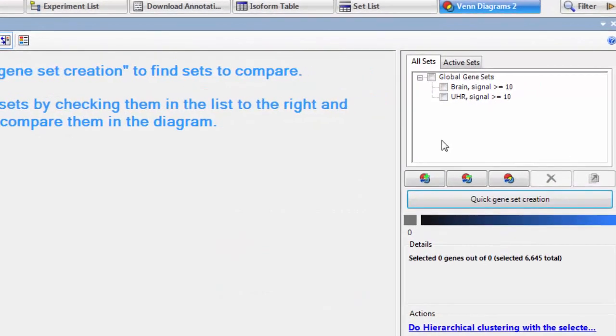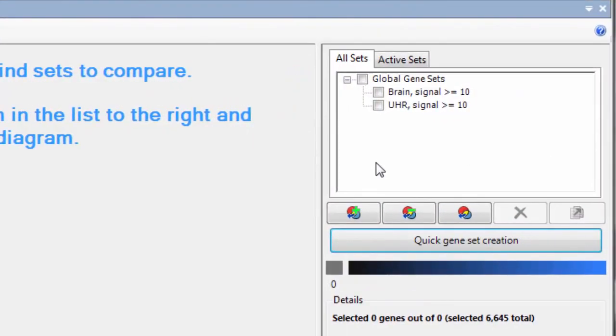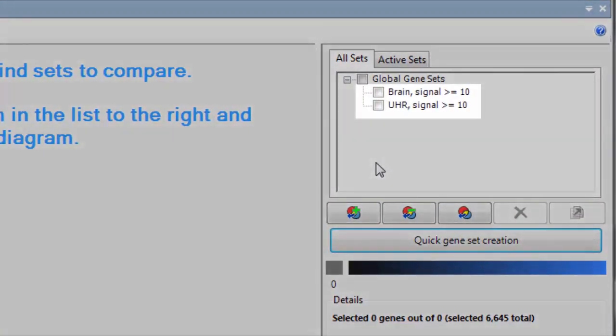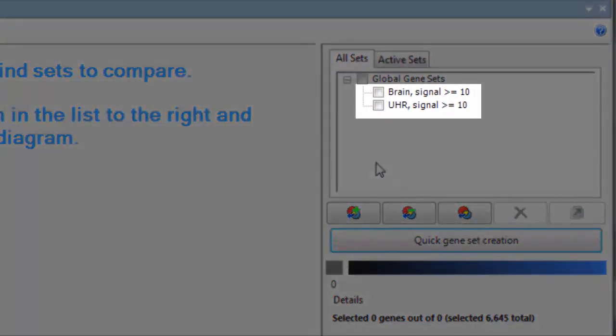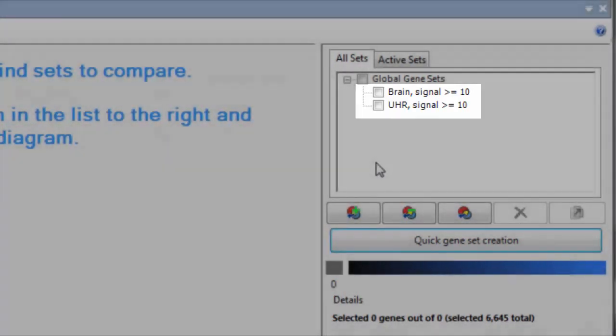You can see that Array Star took me to the Venn diagram view and created two gene sets for me, one for each of my samples, each showing genes with a signal greater than or equal to 10.